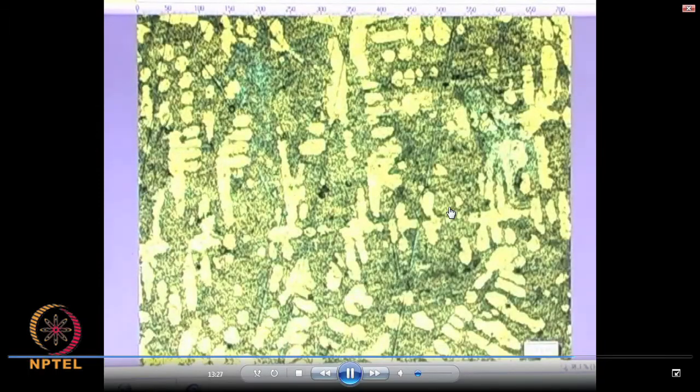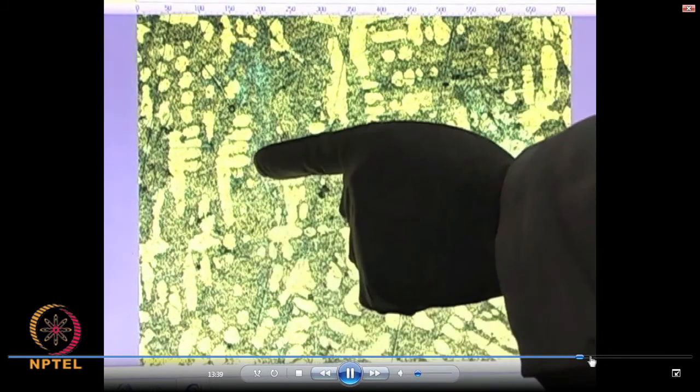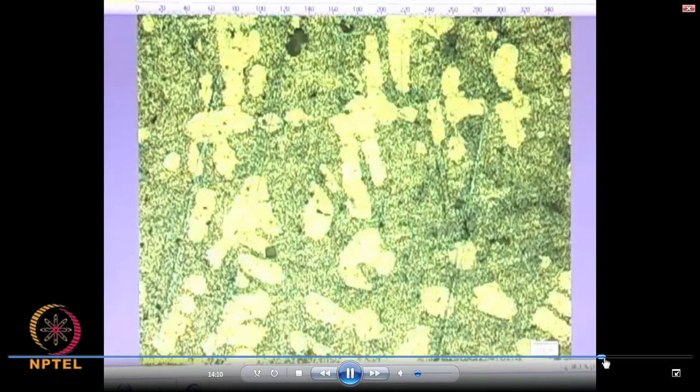This is the aluminium sample. It is an as cast structure. You are able to see that it is a cast structure. For the people who do not have the background for this material, I would say it is a solidified form of aluminium microstructure. These things are called, in metallurgical terms, dendrites, and then you can see much more details of this specimen.